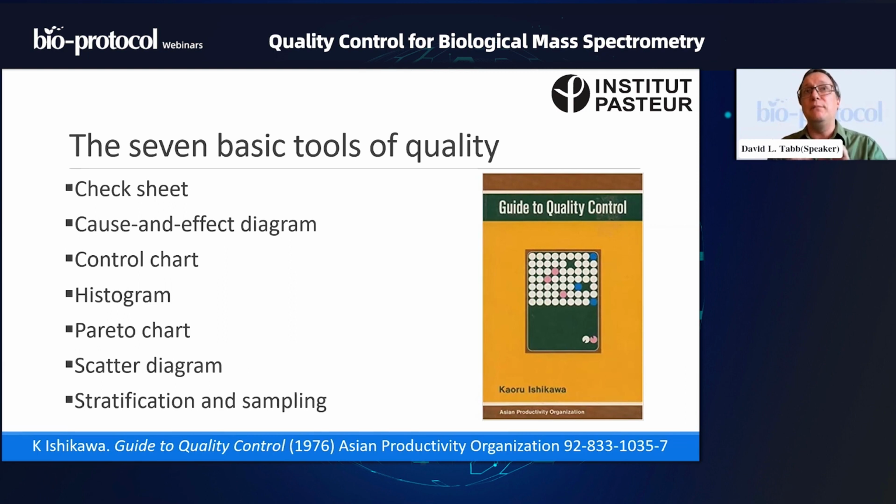If we're able to do a SWATH style experiment or a data independent acquisition experiment on, say, a Thermo instrument, something that has very good resolution is better able to discriminate the intensity of A from the intensity of B, even if they have very similar mass to charge values and very similar retention times.